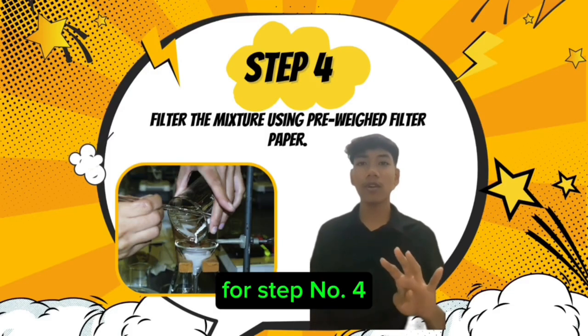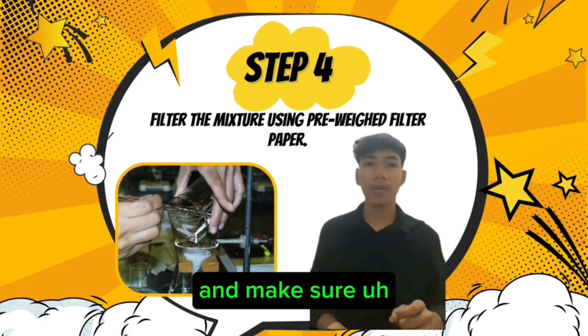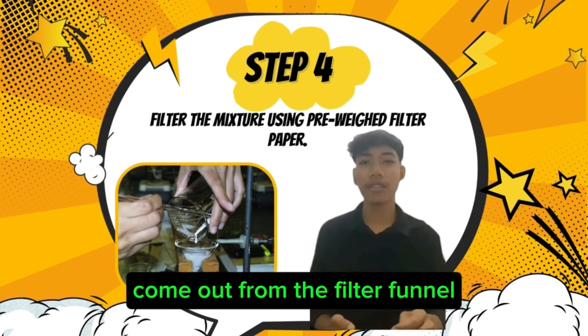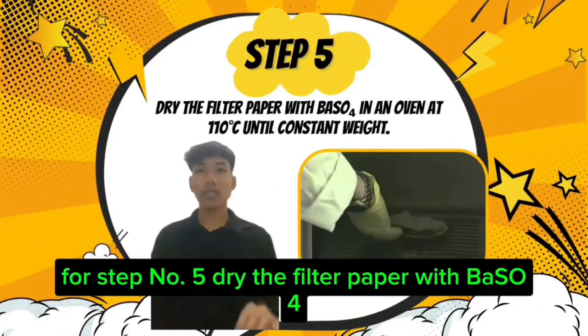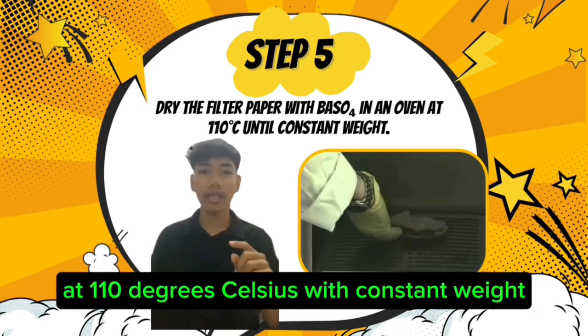For step number 4, filter the mixture using pre-weighed filter paper, and make sure to do it slowly to avoid the solution overflowing from the filter funnel. For step number 5, dry the filter paper with BaSO4 in an oven at 110 degrees Celsius to constant weight.